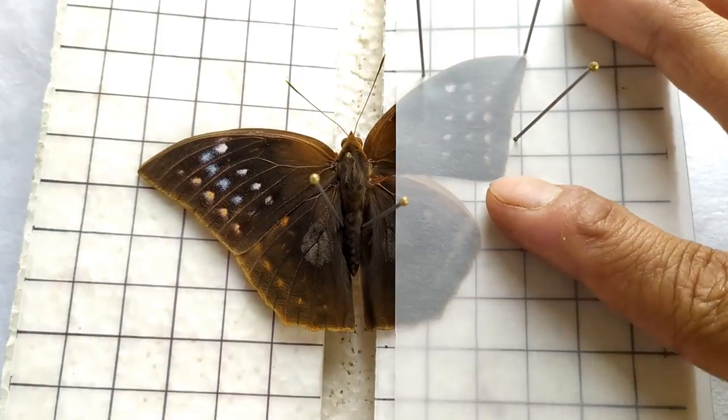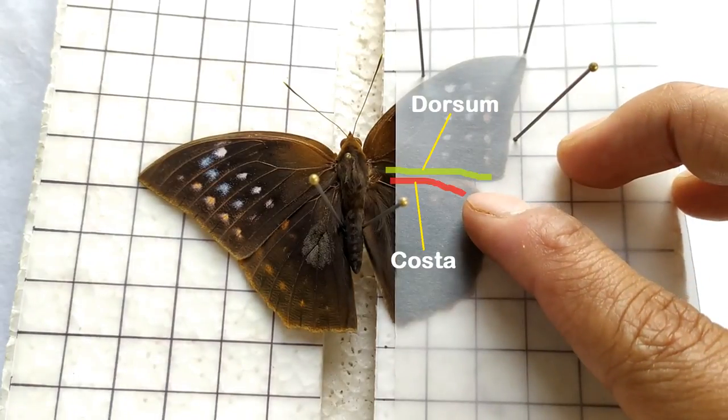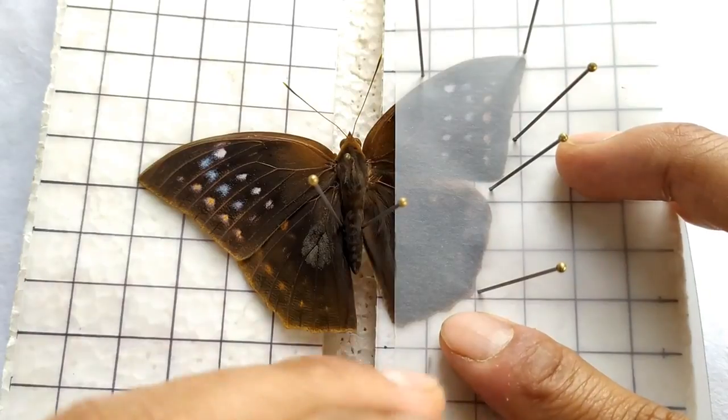Follow the same process with the hind wings. Position the hind wings such that the costa of the hind wing lies just below the dorsum of the forewing. Secure the hind wing by inserting pins through the butter paper at several places along the margin of the wing.